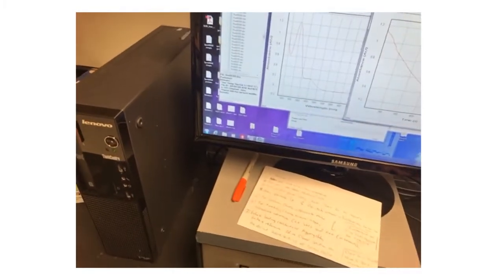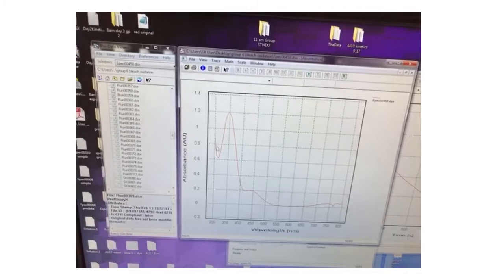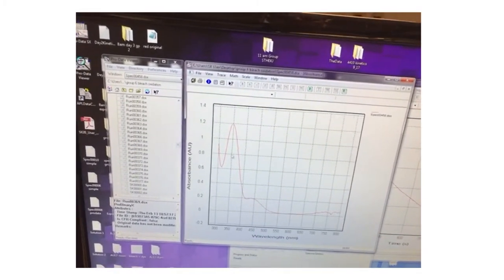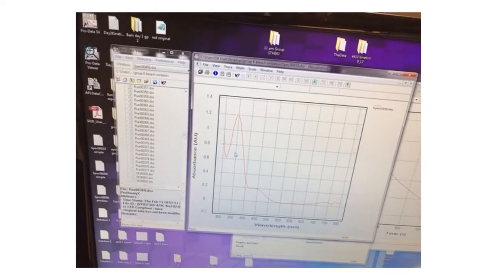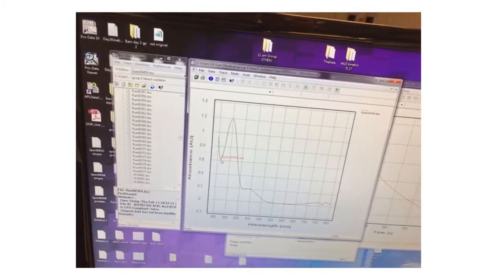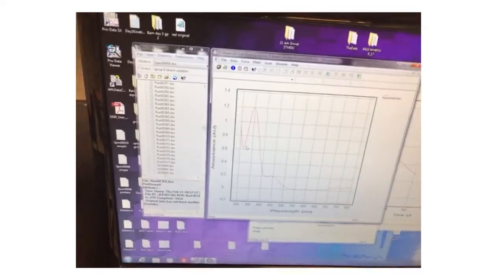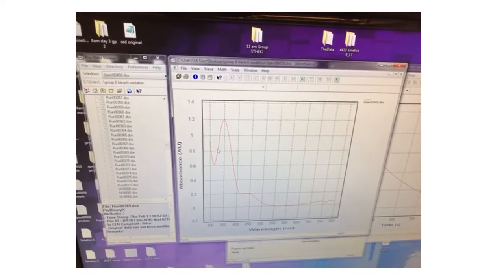So I have on the left what an absorbance plot might look like. This is one of the absorbance scans of potassium dichromate as a function of wavelength. So this is the dichromate not yet reacting, so this is just dichromate in water, maybe with the presence of some acid, in which it's relatively stable, doesn't quite react, or at least react very quickly in that solution.